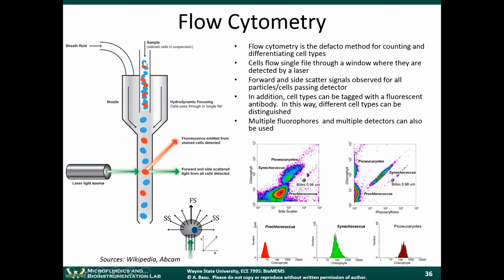This stream that you see here is combined with the 2 streams on the outside, and they form these parallel streams through the length of the channel. Now, 2 things happen. First of all, this sample, which had a concentrated agglomerate of cells, those cells actually get spread out in time, or spread out along the axial direction.